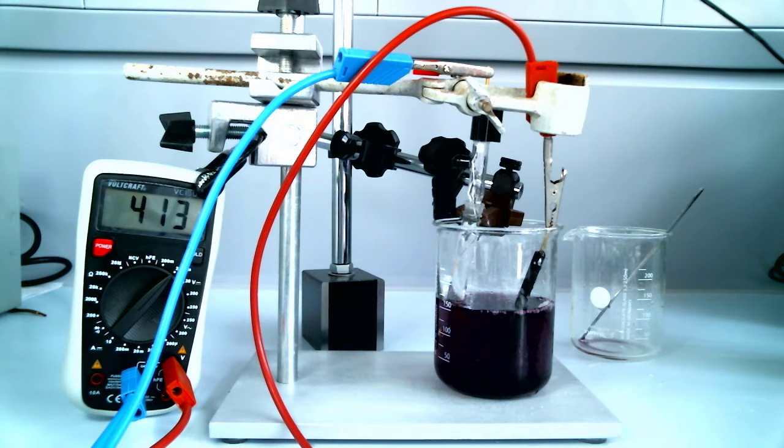What we can see here, however, is that the voltage measured between the two electrodes is not different when we added the salicylate, but it was different when we changed the composition of the solution.